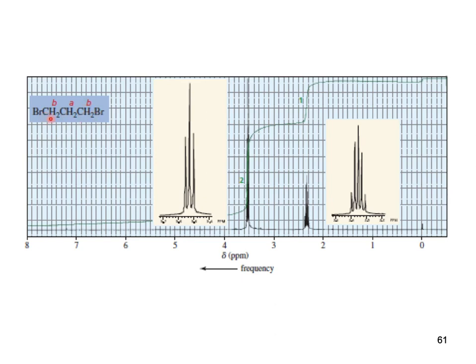This is connected with bromine and this is not, so two different types of protons, that's why it has two signals. The adjacent carbon has two protons, 2 plus 1 is 3, so this one is a triplet. And this proton, how many protons does the adjacent carbon have? 1, 2, 3, 4. 4 plus 1 is 5, so this one is a quintet.